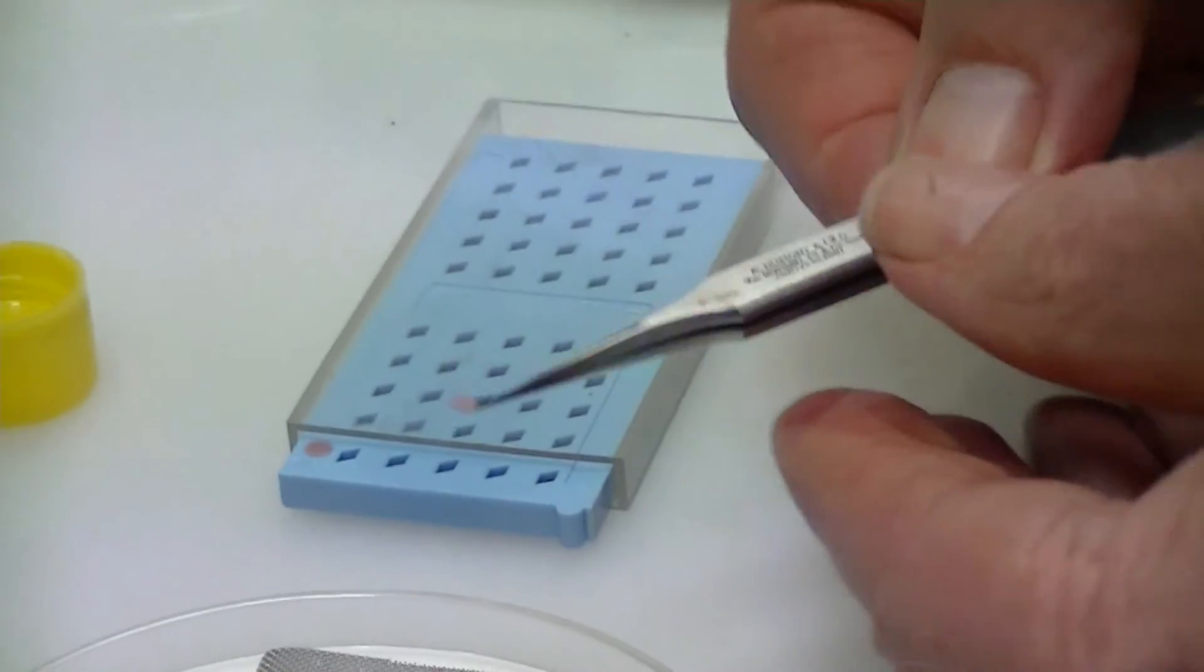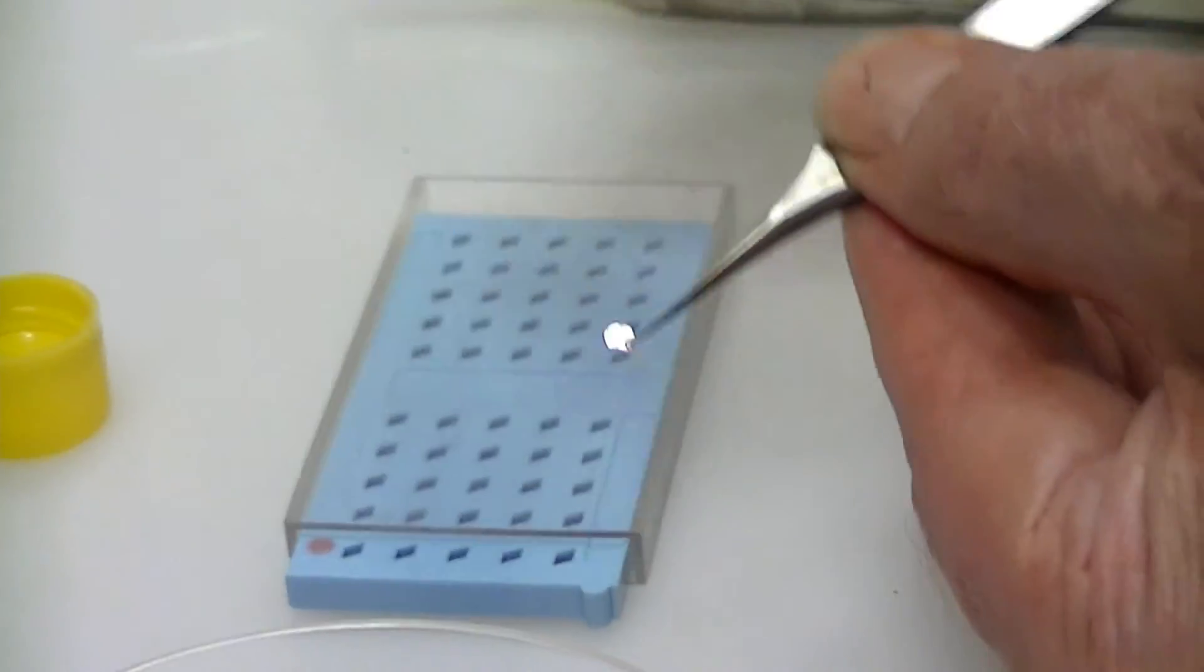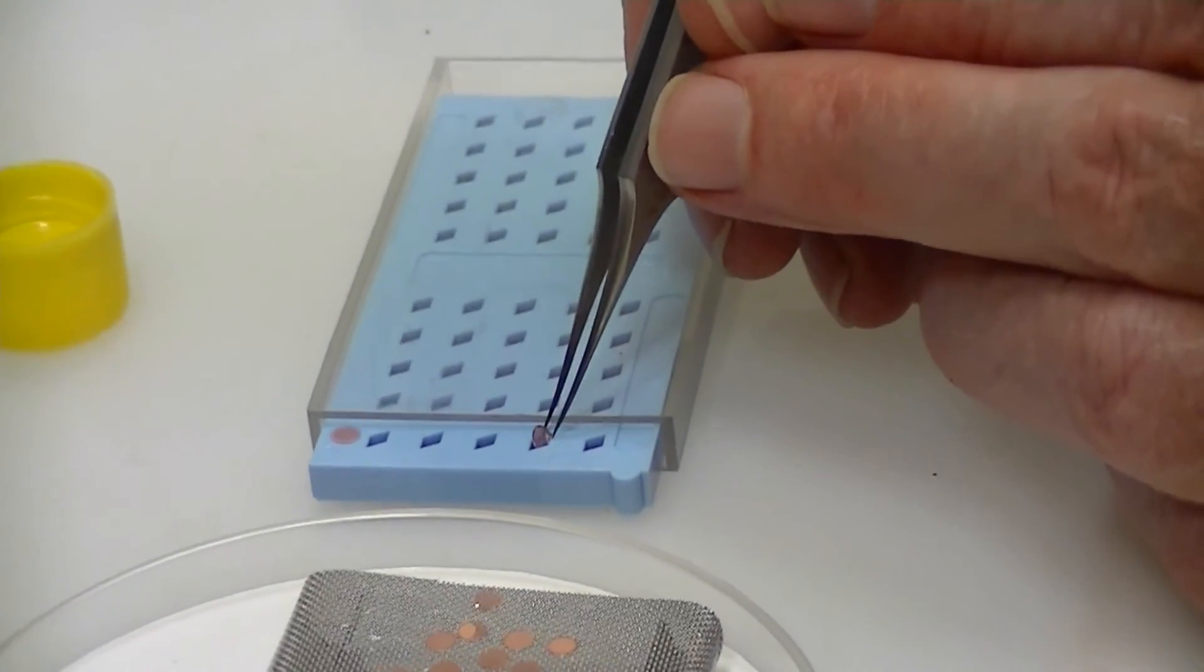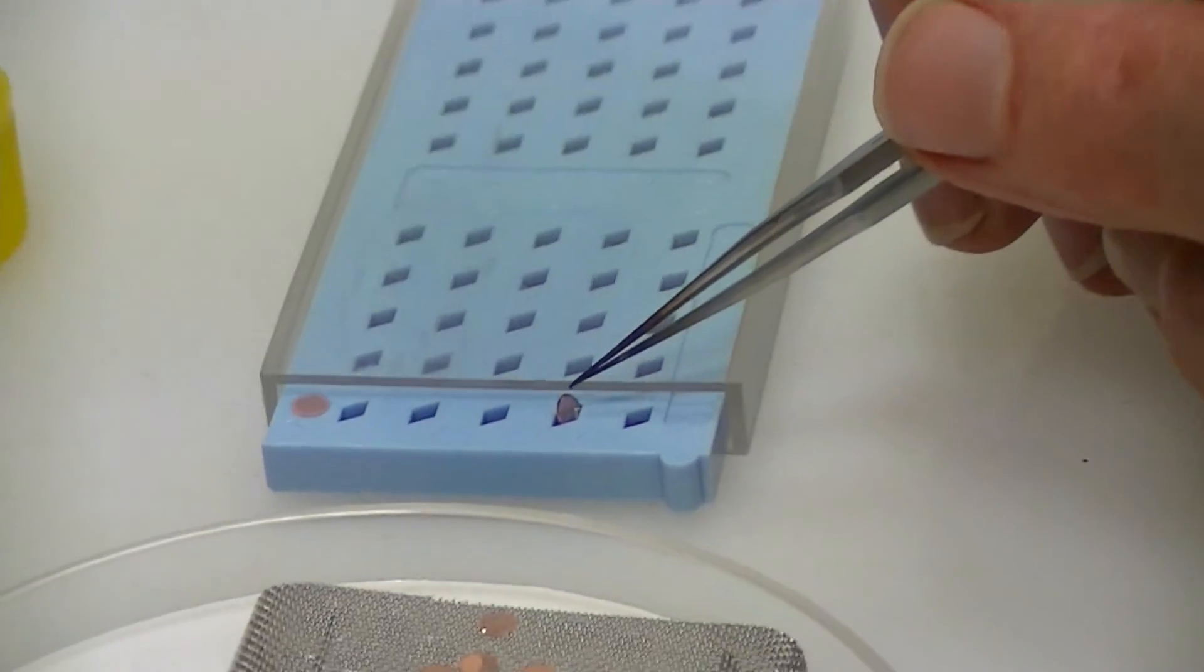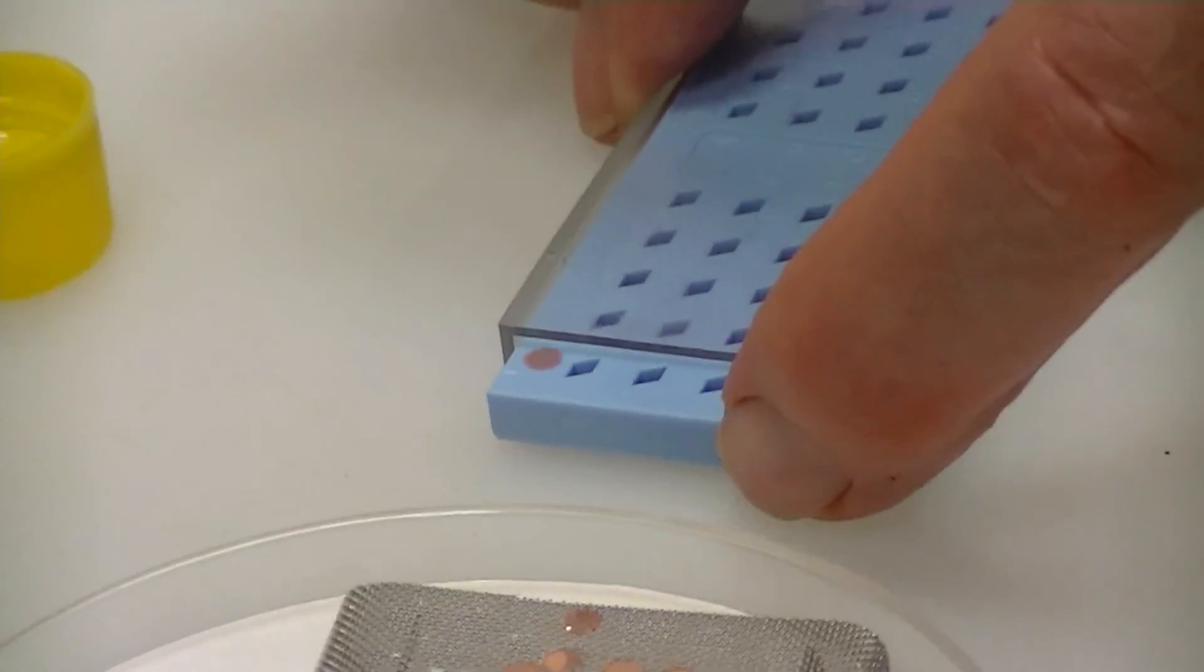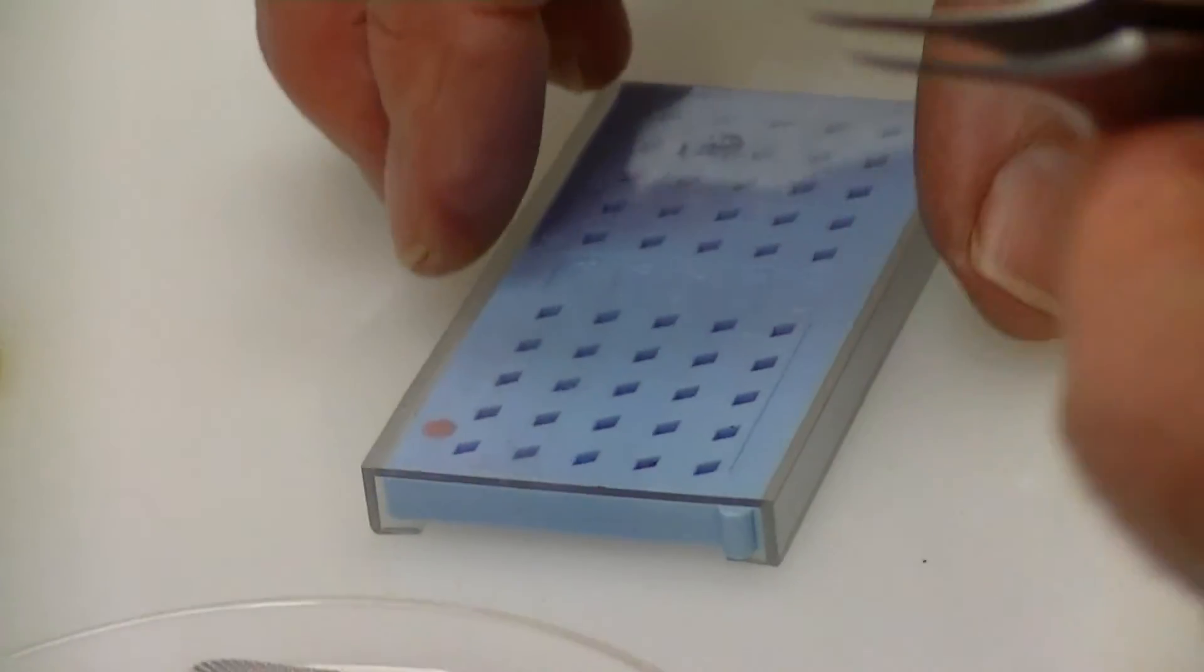Once we've prepared the grid, we can store it for a long time. We often use a grid box of this type where we put the grid directly into a little slot in this container. Those particles will be visible for several years as a negatively stained image. So we close the box and take this now to the electron microscope, mount the grid, and look at the particles.